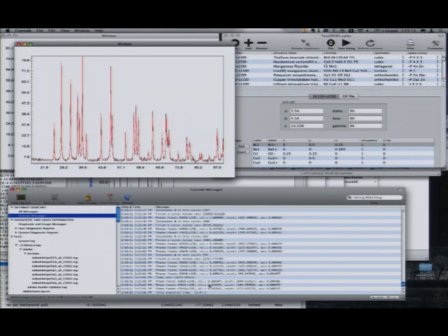For the last program you're showing for the phase identification, is it something you distribute? Okay, yeah, that is a program. It was developed inside a European project. There is a consortium, so SMEs. In principle, it belongs to these SMEs, okay? But in the SMEs, there is no one working in diffraction. The only one is in RTD, so has not the right for it. And actually the best thing for this one is probably to get an agreement with a company like the one who distributes the ICSD, because it works better if you have a complete database.